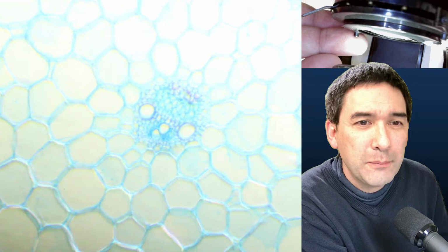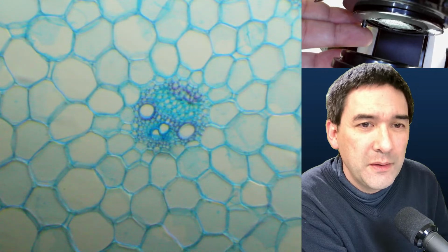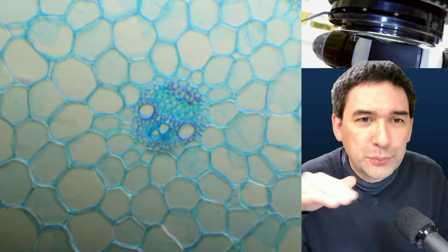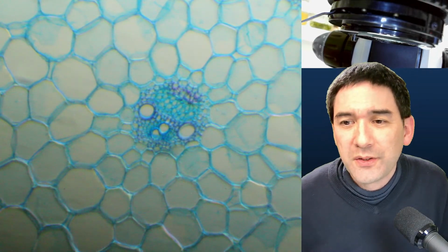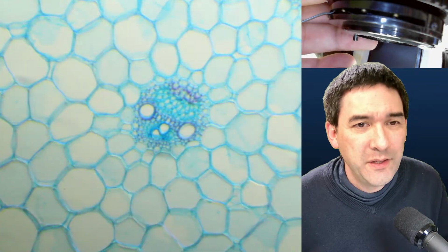It's right now at the border, maybe not quite as evident as before, but you can also see now that one side of the cell wall is much brighter than the other one. So again, you get a little bit the impression of a three-dimensional view. This is the thing that I wanted to show you, but again, it doesn't really light up quite as nicely as some of the other specimens.